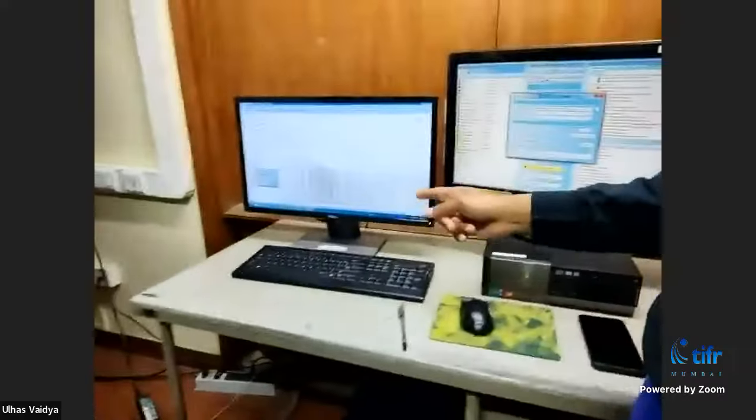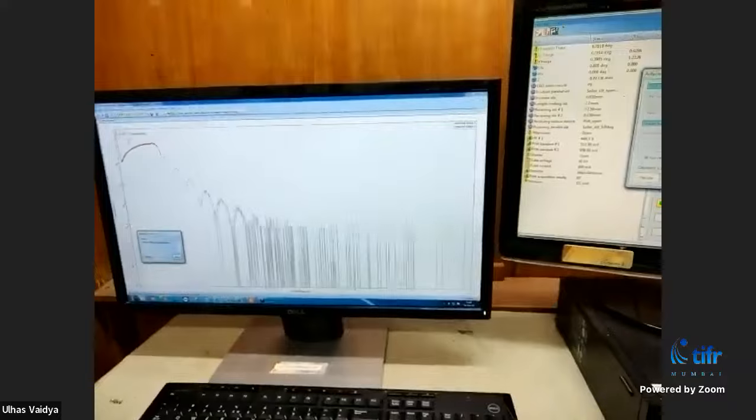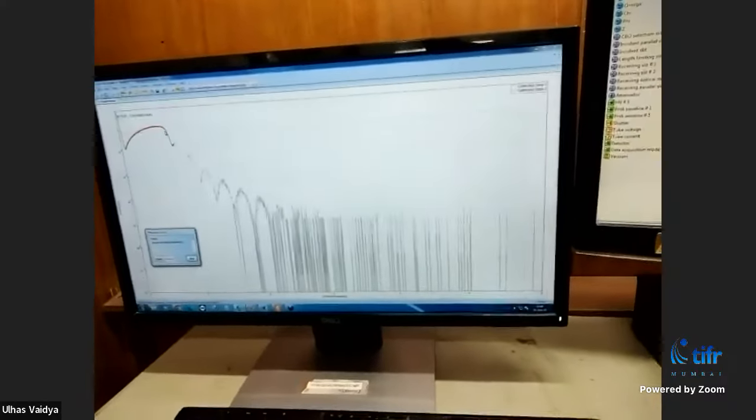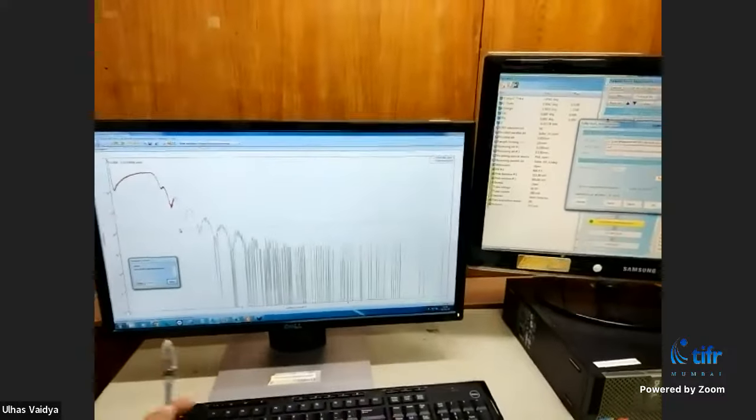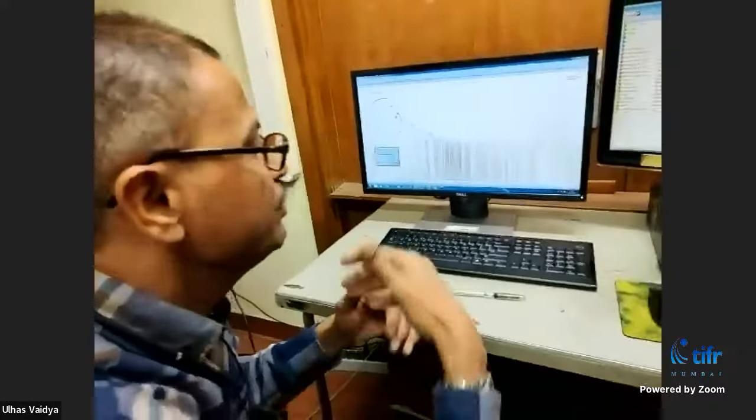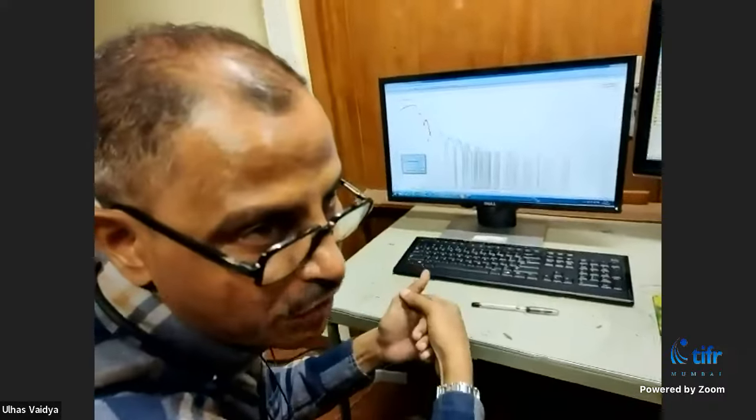From the scan, we can see there is a critical angle at around 2-theta = 0.7 degrees, i.e., 0.35 degrees theta. Then there are fringes — counting 1, 2, 3, 4, 5 fringes from 0 to 5 degrees. Multiply by 2 to get the approximate thickness. There is software that takes this scan, does a fast Fourier transform, and gives the approximate thickness. This is a non-destructive method — you get thickness within about 20 minutes without cross-section preparation.